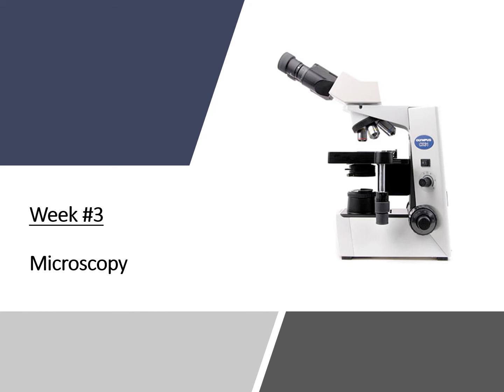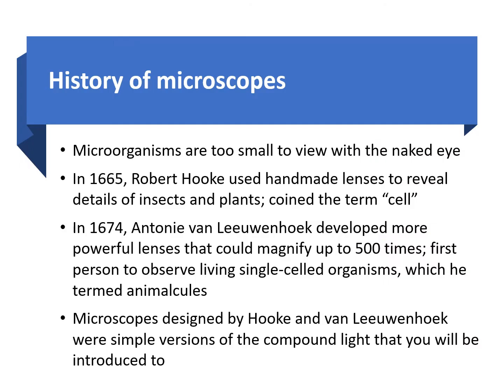Hello everyone. This week we're going to talk about microscopes in the lab. So let's go ahead and get started. Microscopes are used to view microorganisms that are too small to be seen by the naked eye.